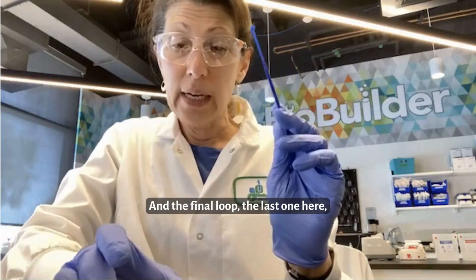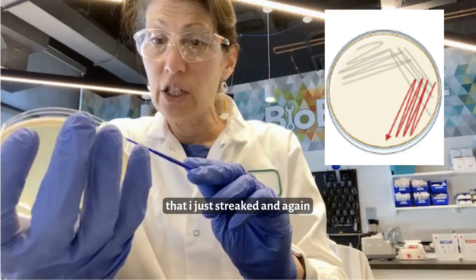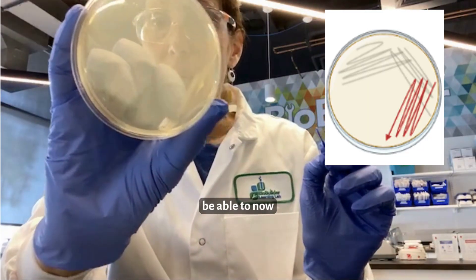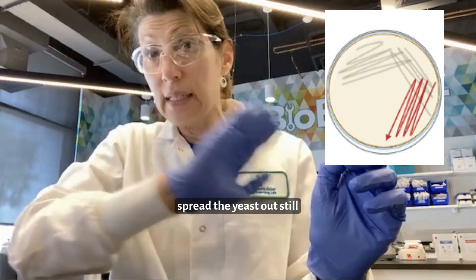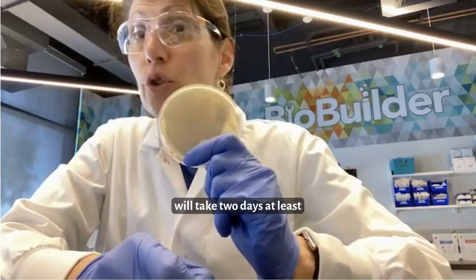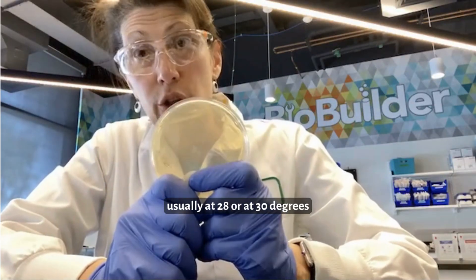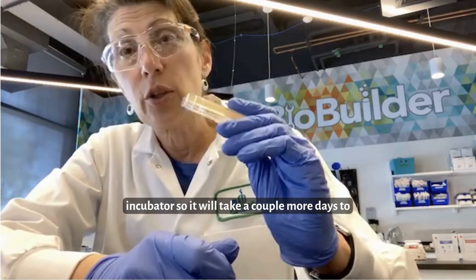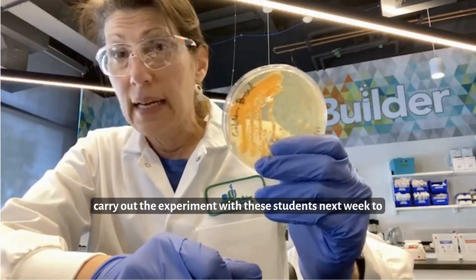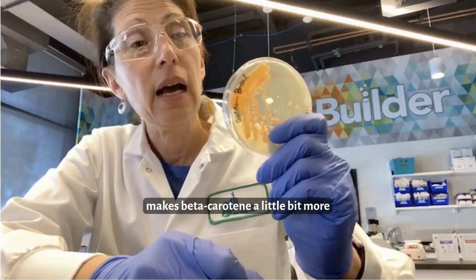The final loop is going to take the fewest cells from that area of the petri dish that I just streaked, and again go back and forth to spread the yeast out still more across the surface. I will grow this — it will take at least two days to get colonies on YPD, and they grow not at 37 degrees but usually at 28 or 30 degrees in an incubator. That will allow me to carry out the experiment with the students next week to try to make this strain that makes beta-carotene a little bit more reliable.